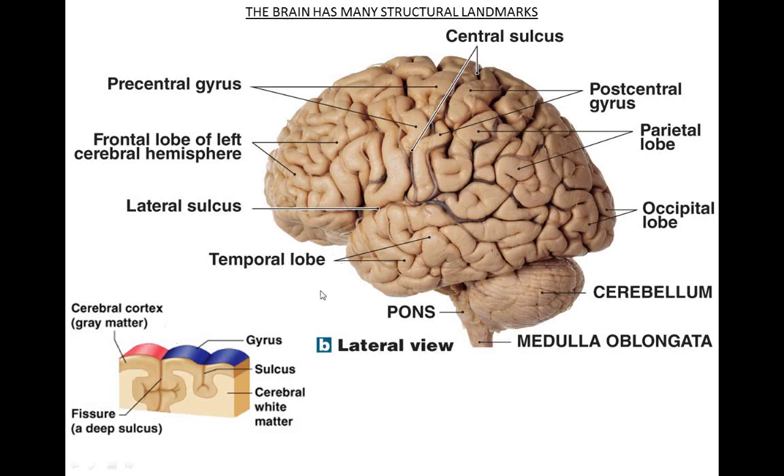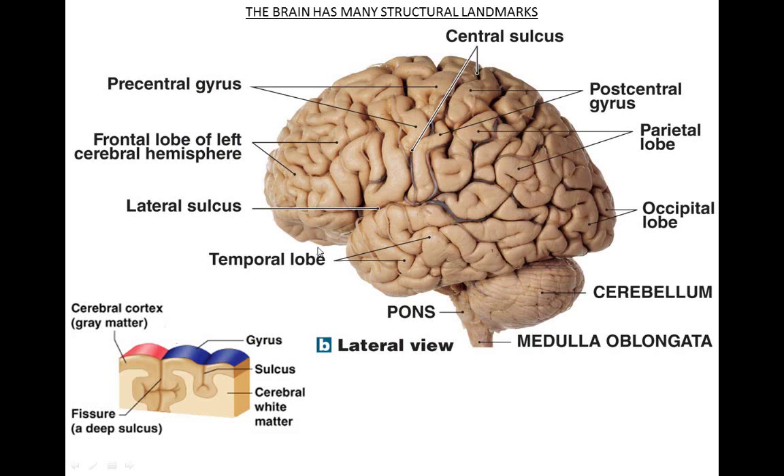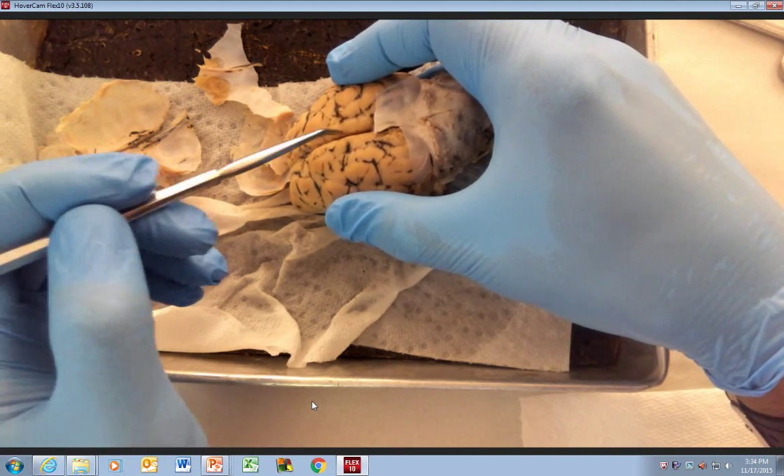If you look at the slide, the gyrus is this outcropping here, and then when it curves down — remember, this is flat tissue. If you were to draw a line right here, it would be flat tissue, and then it curves down, and that's what makes the gyrus versus the sulcus. A sulcus that goes really deep is referred to as a fissure, or one that goes across. So this right here is the longitudinal fissure — it's a deep sulcus. These are the gyri that you can see here.